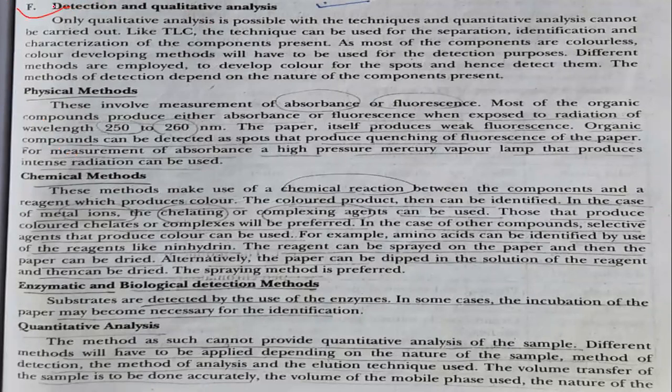Detection and qualitative analysis. Here some of the methods are physical methods, some are chemical methods. You can use enzymatic and biological detection methods. Here only qualitative analysis is possible with this technique, and quantitative analysis is not possible by this technique.